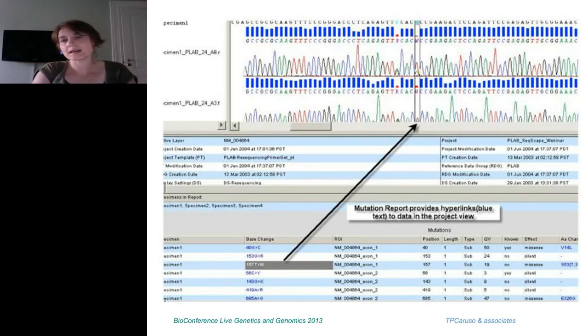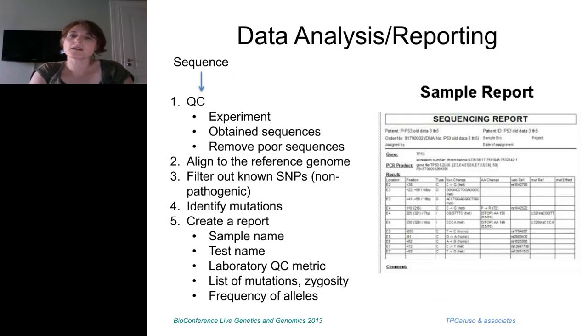Now, I put this nice report here for you just to have a nice break and an introduction to the next step. We're all familiar with having your sequence nicely from Sanger, having a list of mutations, what really is the nature of the mutation, and then what's the effect and what is the change in protein.